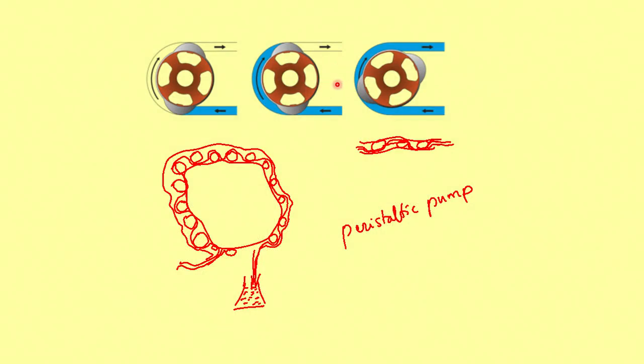and this peristaltic pump is also used in our day to day life, where people with diabetes undergo dialysis. For example, if blood has to be taken out from a body and then re-put inside the body again, then we need a peristaltic pump, because we do not want the blood to come in contact with any of the external agencies like air, water, metal parts and many other things. So, this is how the peristaltic pump works. The principle is very simple, very nice.